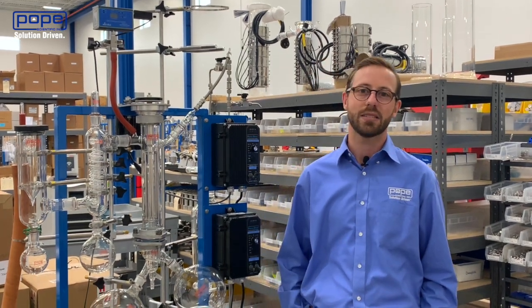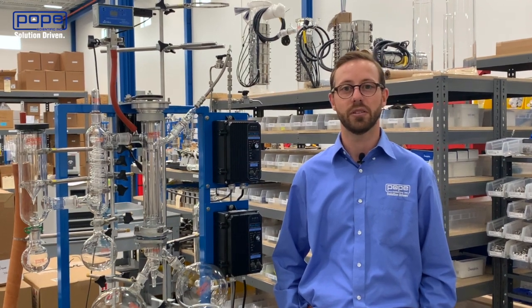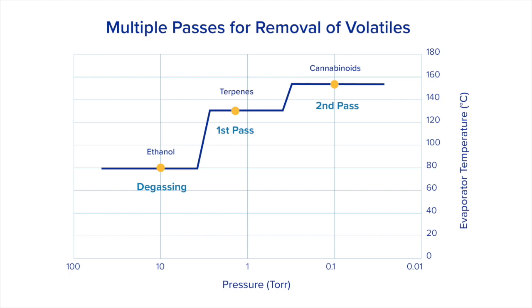In that case, it's likely that you have volatiles in your feed material causing your vacuum to raise. Specifically, when you're talking about the processing of cannabinoid extracts, you're going to be doing a two-pass operation. In the first pass, you're trying to remove your lighter materials such as terpenes. And then on your second pass, you're actually trying to distill the cannabinoids away from those heavy waxes, sugars, and fats.